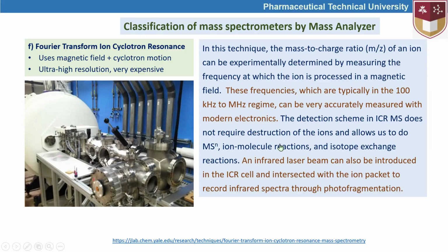So this is the regular type of mass analyzer. Again, it is very expensive, but it provides ultra high resolution. So this is a quite expensive tool. I think in Uzbekistan, we don't have this kind of ultra high resolution providing cyclotron resonance.